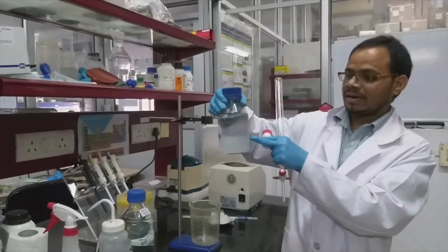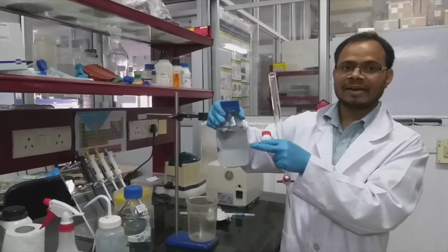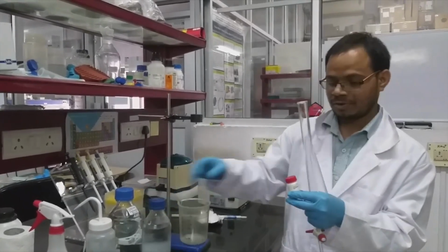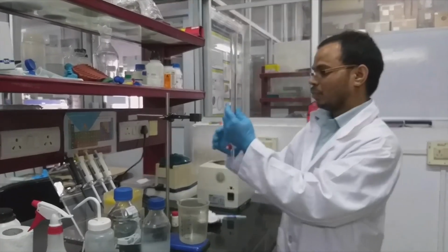So this is already overnight swollen beads. So we can use it directly. We need not wait for another 24 hours. So I am going to keep this one.